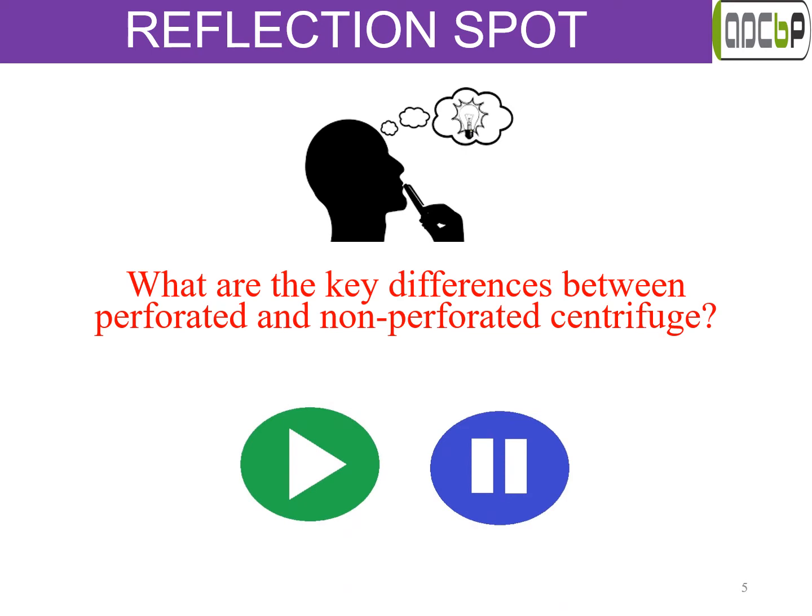Now let's pause the video and think on a question, that is, what are the key differences between perforated and non-perforated centrifuges? You can write down the answer in the notebook, and once you finish writing it, you can play the video to get the answer.